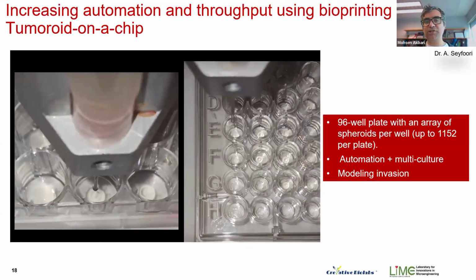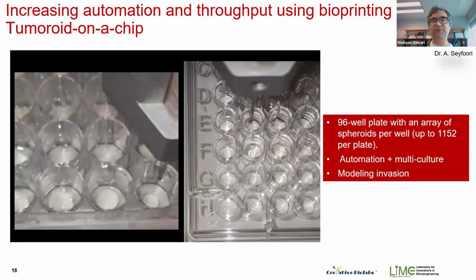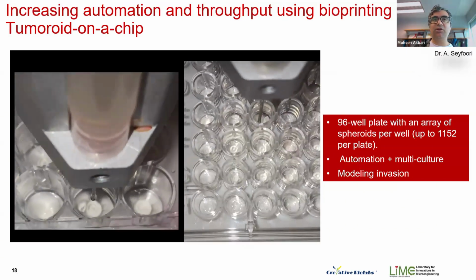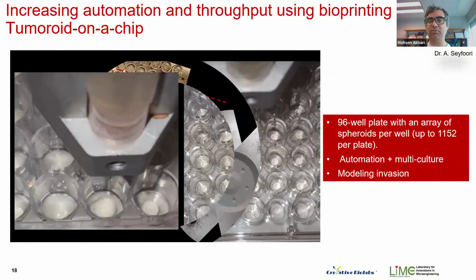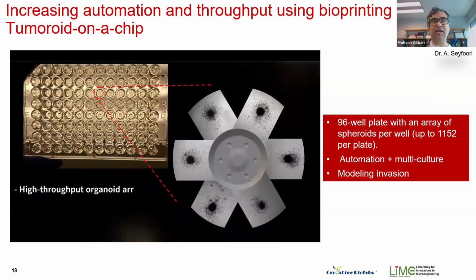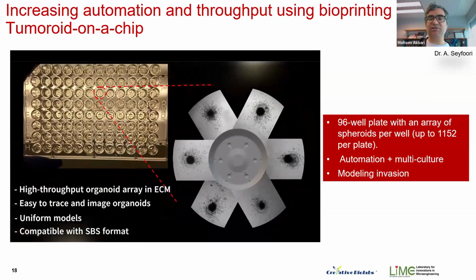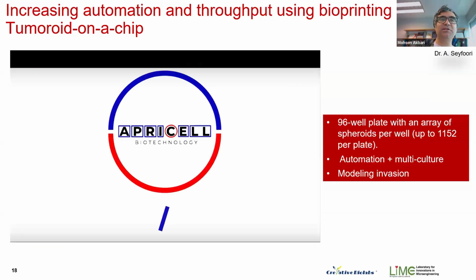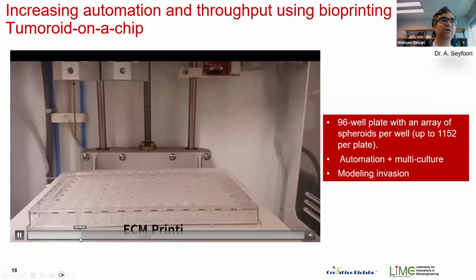One of the challenges in using these wells is that when you want to deliver the cells or the extracellular component, we need to use pipettes, and pipetting itself is labor intensive, and it also causes challenges related to reproducibility and delivery of the same amount of materials.